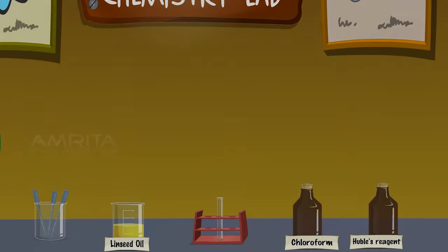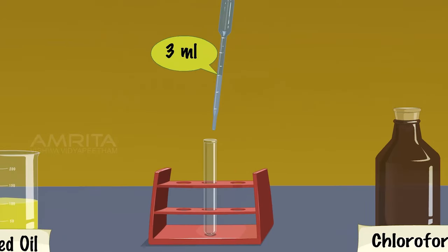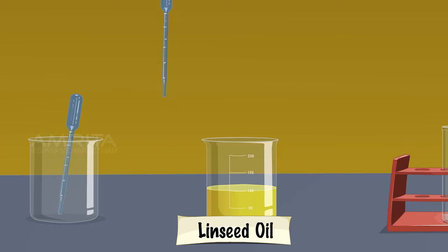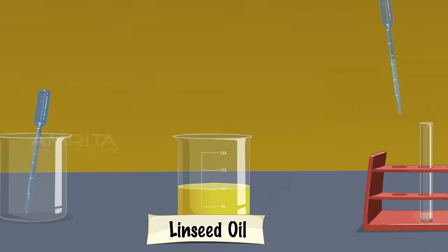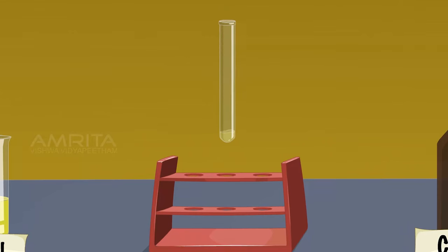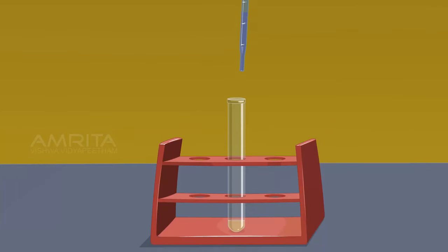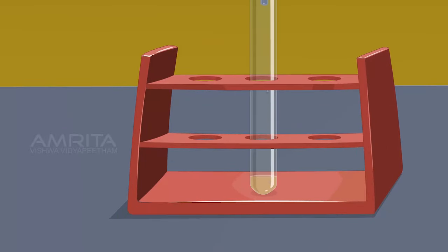Linseed Oil. Using a dropper, take about 3 ml of chloroform in a test tube. Using another dropper, take a small quantity of linseed oil and add about 4 drops into the test tube. Shake the test tube well. Add about 3 drops of Hübl's reagent into the test tube containing the mixture of chloroform and linseed oil. The violet colour of iodine in the Hübl's reagent fades away, indicating that linseed oil is more unsaturated.